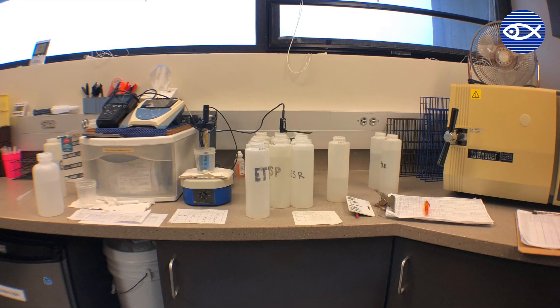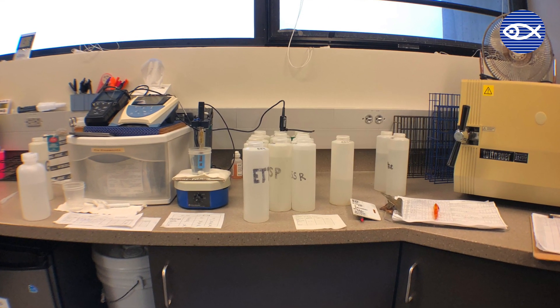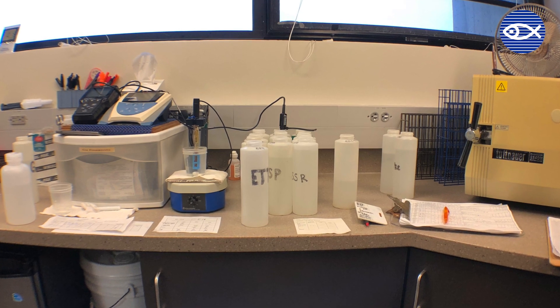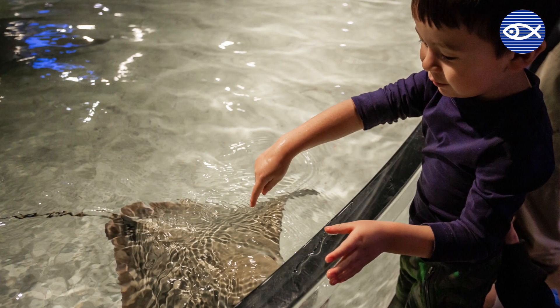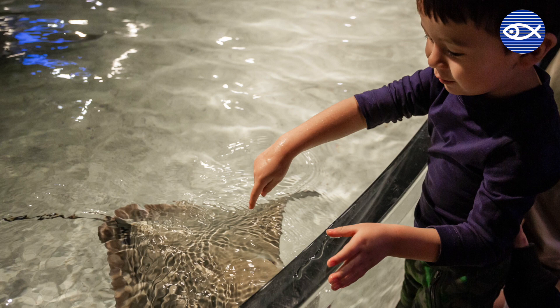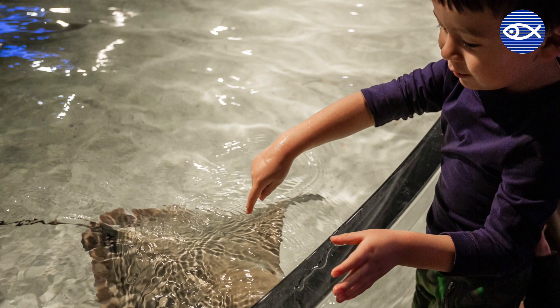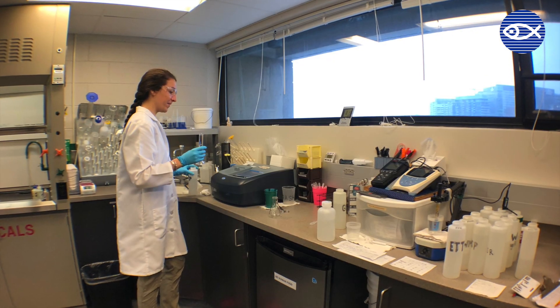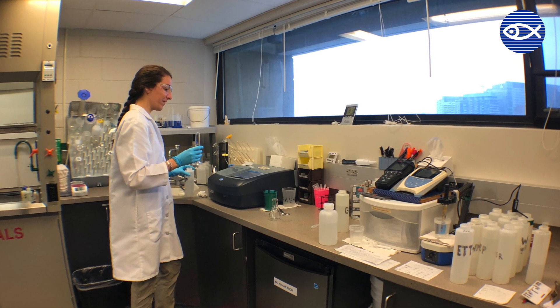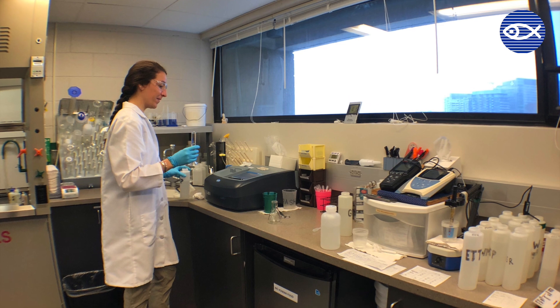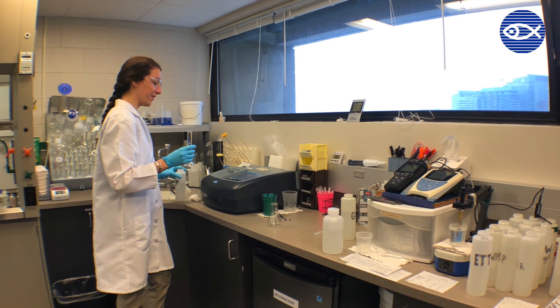We do bacteria testing on all the systems that have people touching them. So like the shark and ray touch tank, for example, people get to put their hands in the tank. So we have to run bacteria tests on that to make sure that it's an okay level for humans to come into contact with. We also run bacteria tests on all the other systems as well, but those ones have the strictest guidelines.